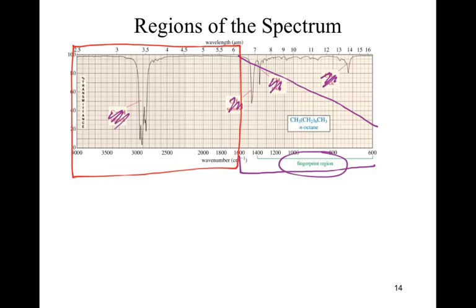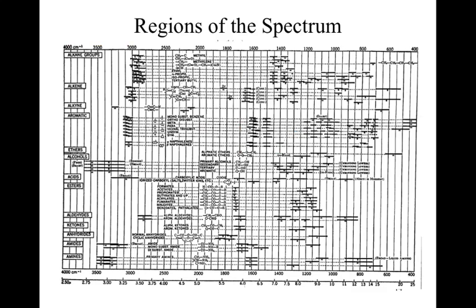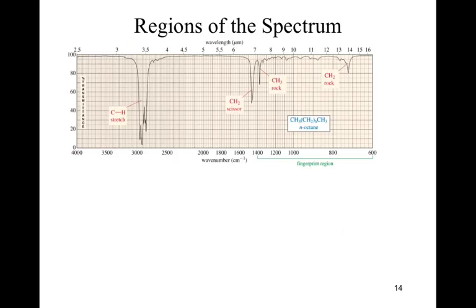Does this signal, okay, let's say these peaks here, what does that look like if I go back to, say, that previous table? Okay, and this is where it gets rough. You'd go through and say, okay, where did that signal show up? Well, it shows up about 3000.